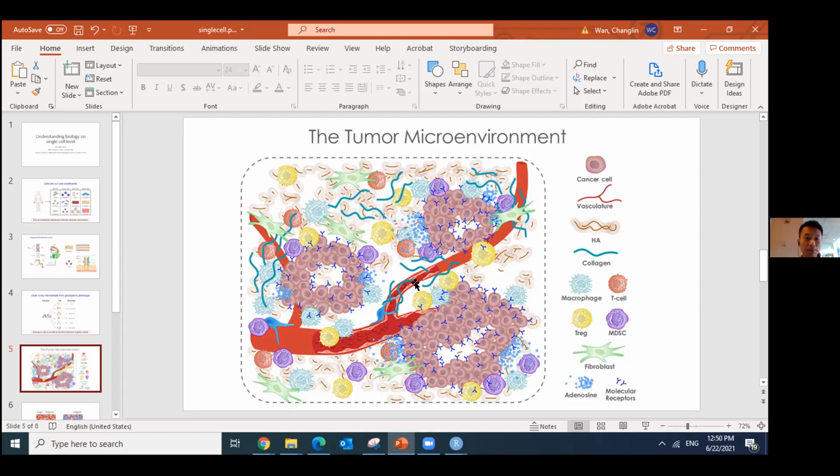Yeah, this I could see. I mean, the number of cells, like the video expressed, in the retina that we really did not even know were there. That's amazing to me, to have a tool that can graphically analyze those samples and sort them into groups in that quick a time. You said the computer was running slow. I thought it was super fast for all the data that it was looking at.